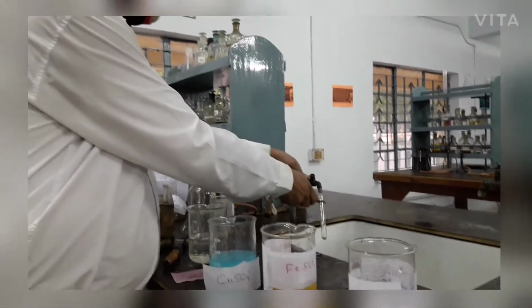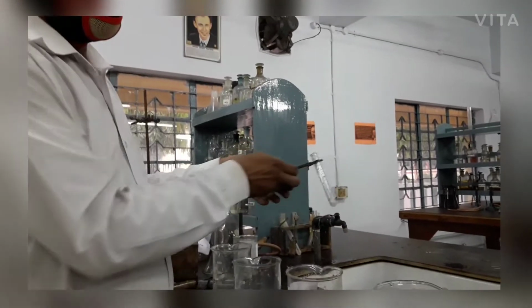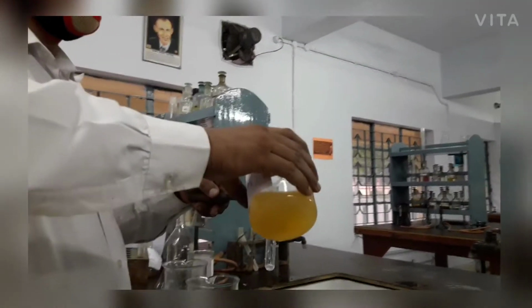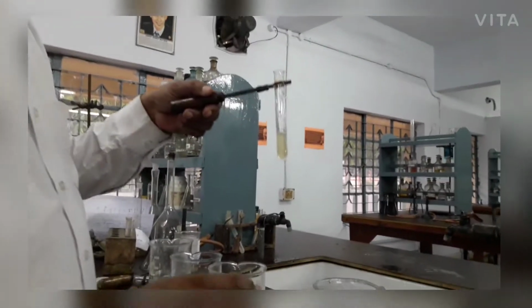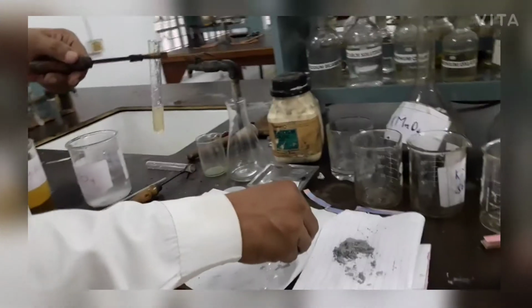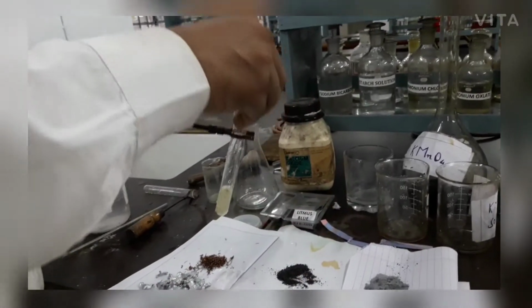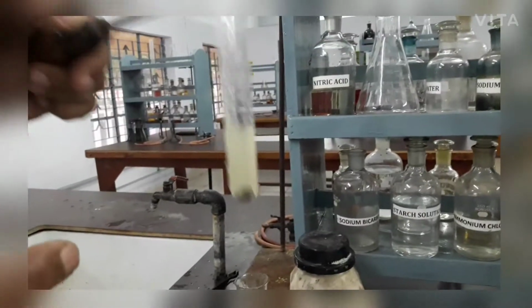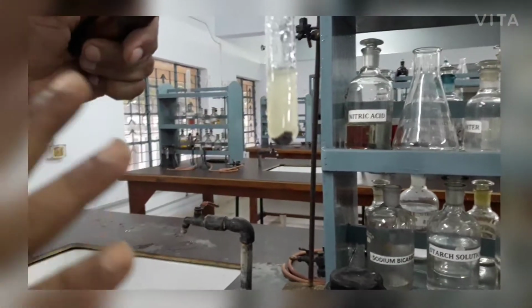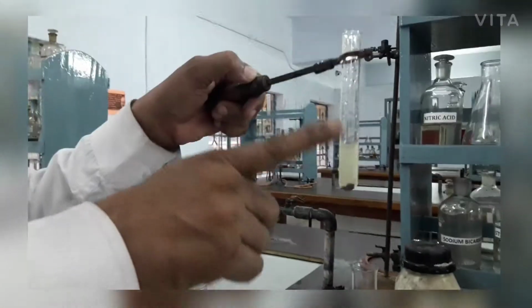Again we are taking the same solution, iron sulfate, and now we are adding iron metal, and we wait for the reaction. No reaction, means iron cannot react with iron sulfate.